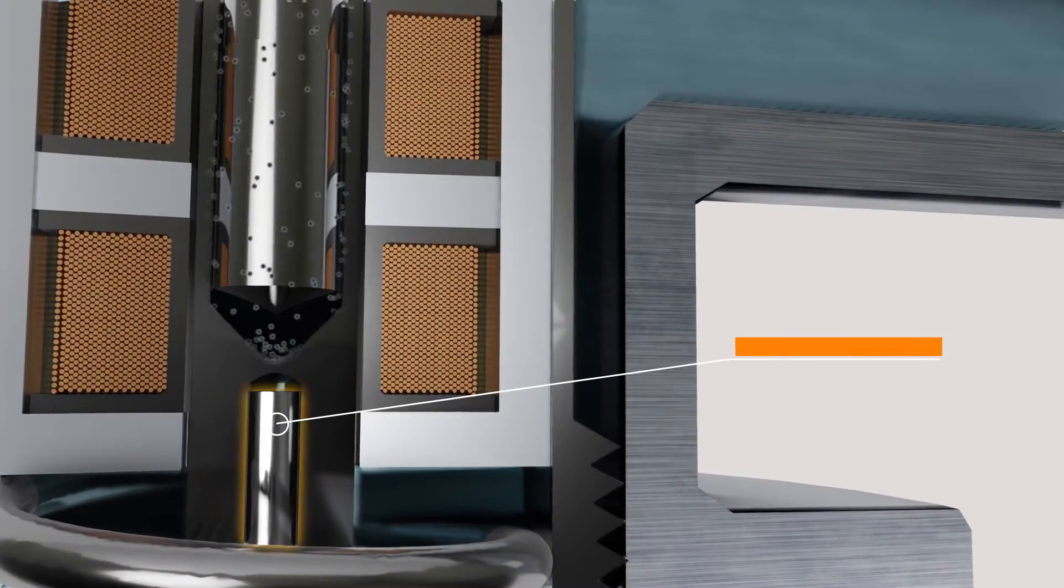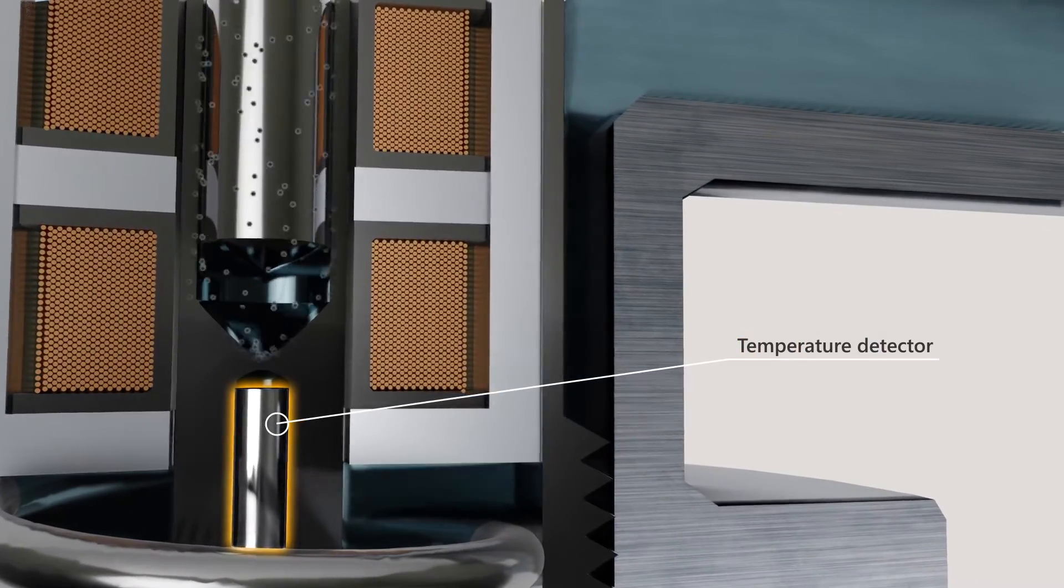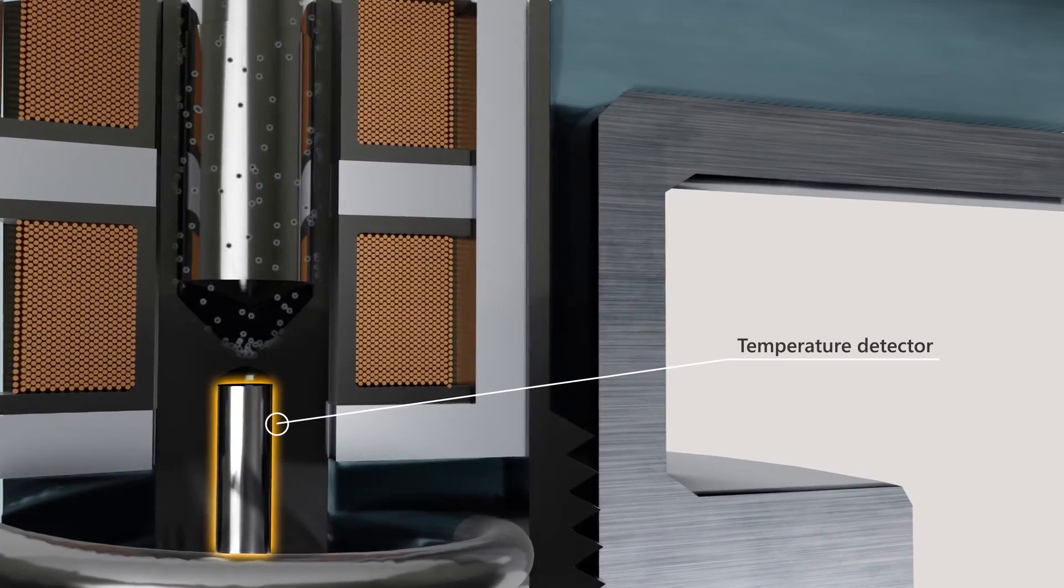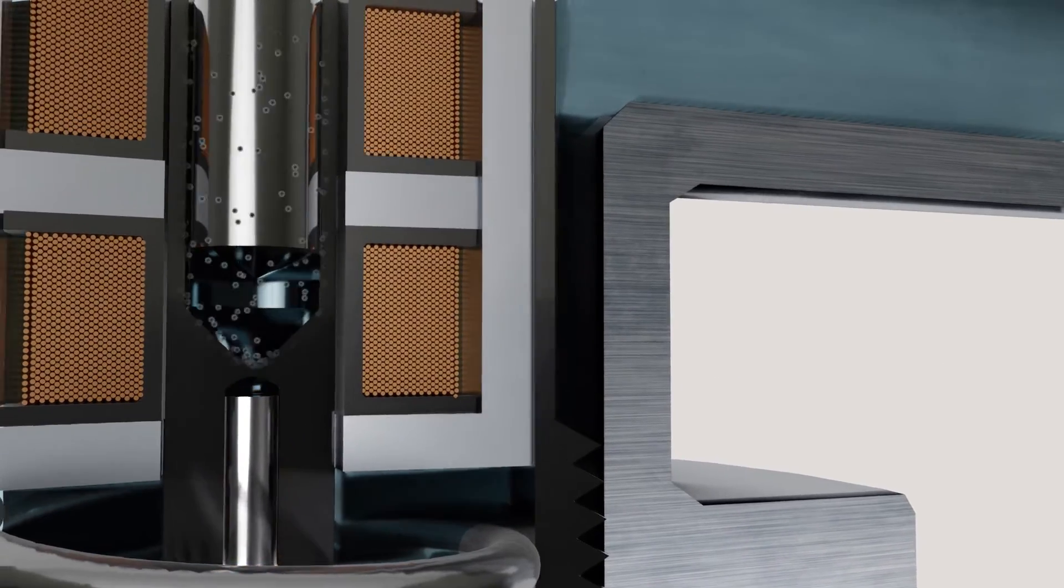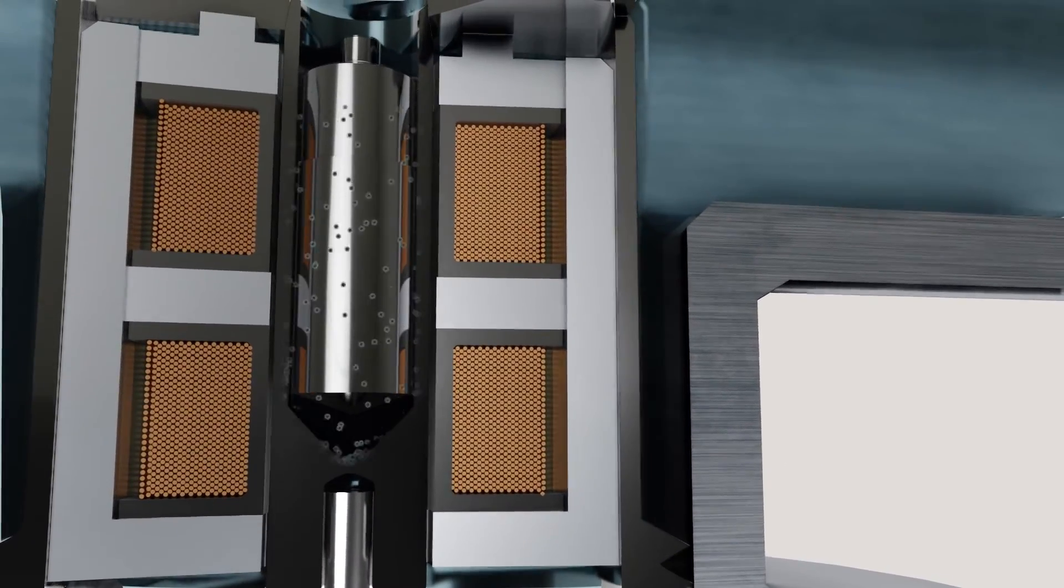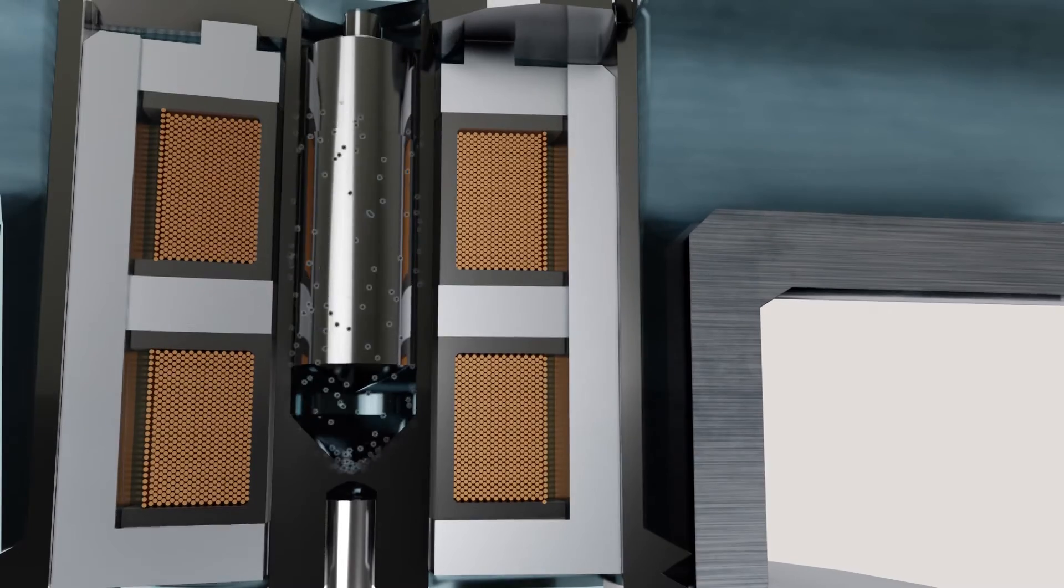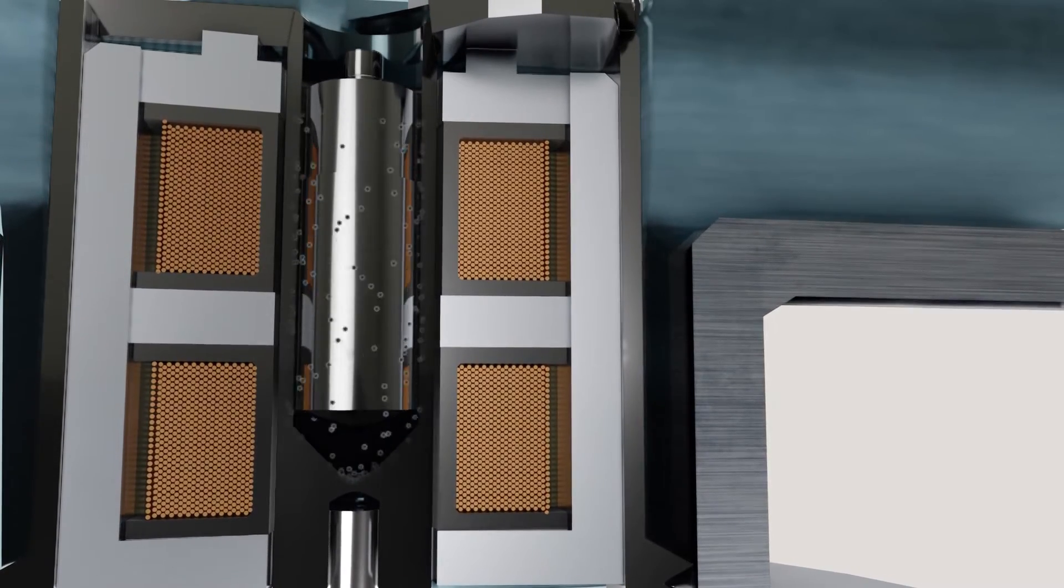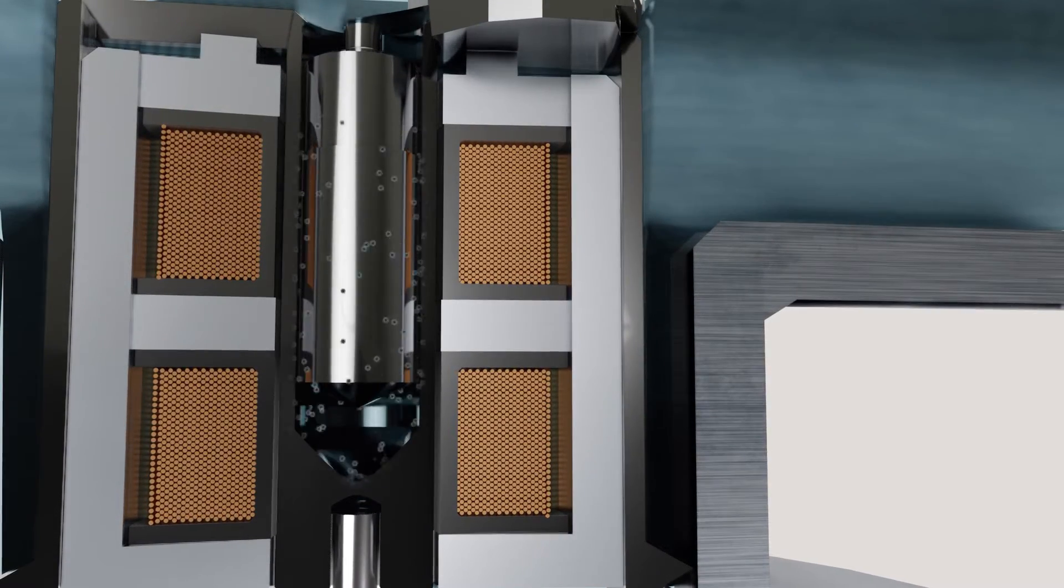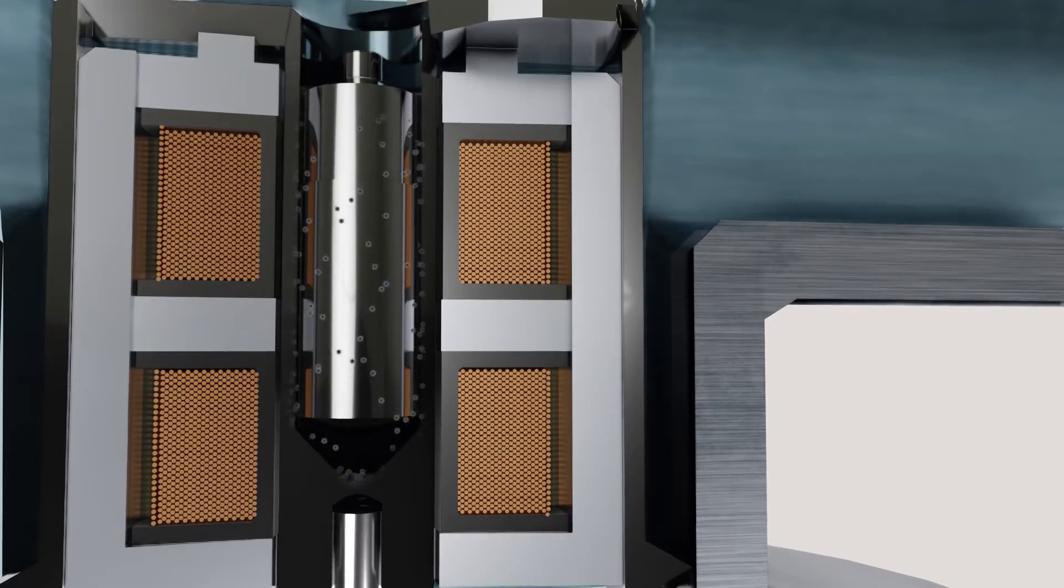An internal temperature detector senses actual temperature inside the measurement chamber. The system can calculate temperature compensated viscosity, which increases its accuracy under ever-changing environmental conditions for direct comparison with laboratory data.